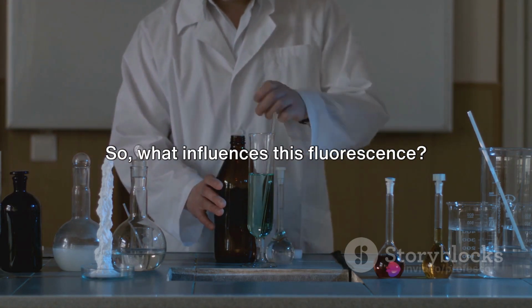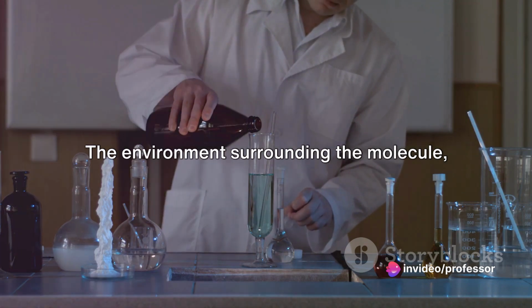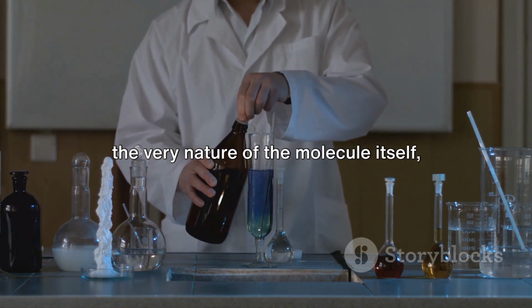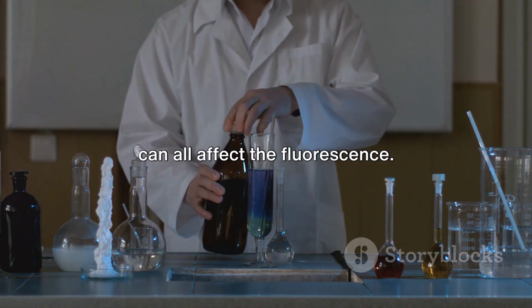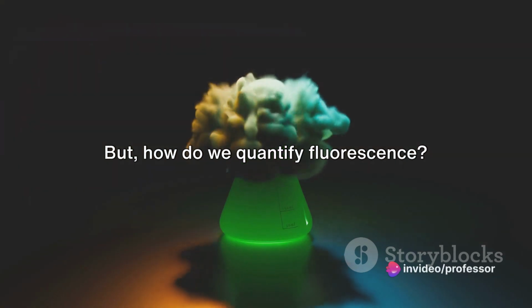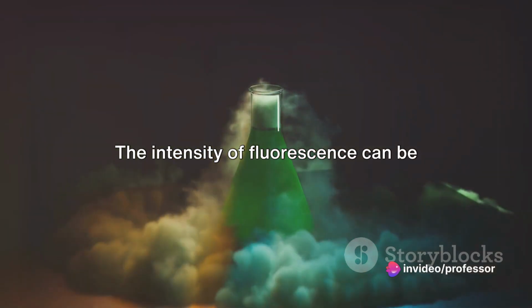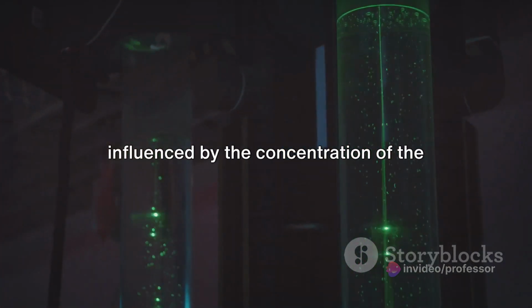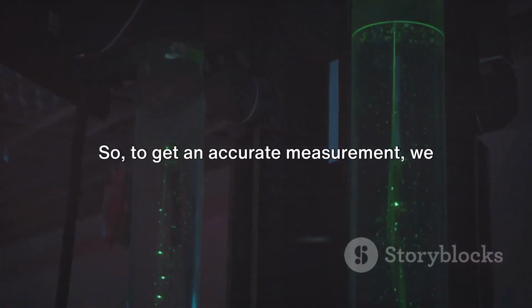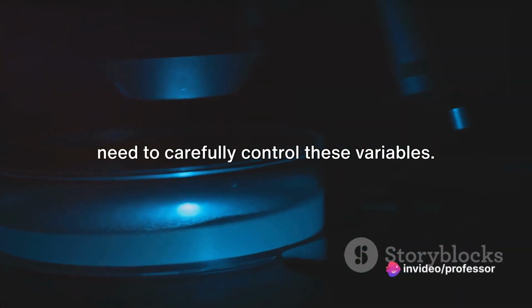So, what influences this fluorescence? Several factors come into play. The environment surrounding the molecule, the wavelength of the incoming light, and the very nature of the molecule itself can all affect the fluorescence. But how do we quantify fluorescence? Well, it's a little bit tricky. The intensity of fluorescence can be influenced by the concentration of the fluorescing molecules and the power of the exciting light. So, to get an accurate measurement, we need to carefully control these variables.